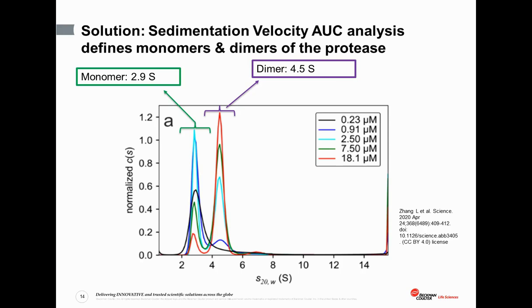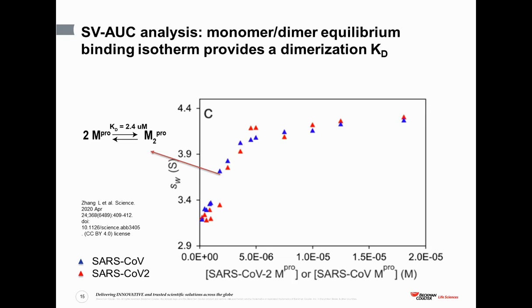And that's really very interesting because it tells us that this protein does, in fact, dimerize. So what can we do with this? What they did using this experiment series is that they then went ahead and asked the question that, okay, so it dimerizes. Can we actually go ahead and find a binding constant for this? And they did, in fact.